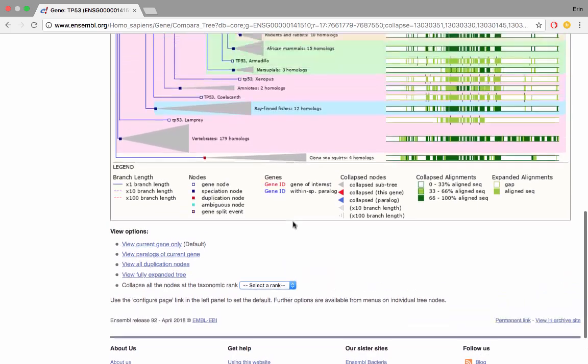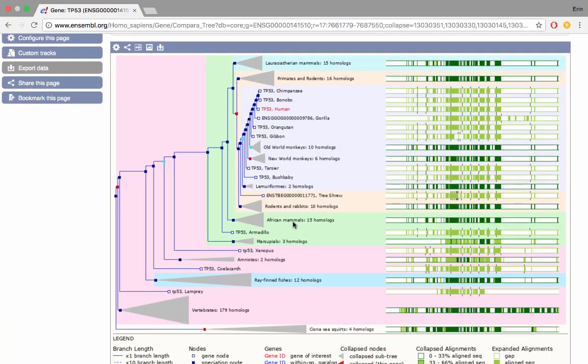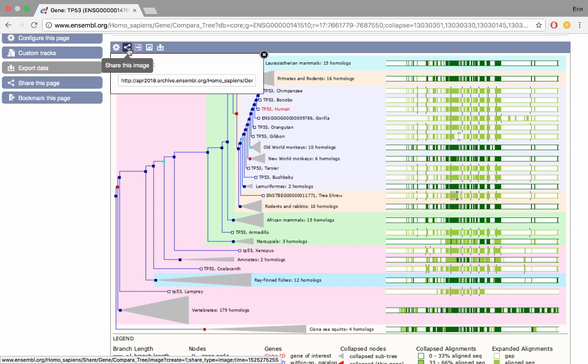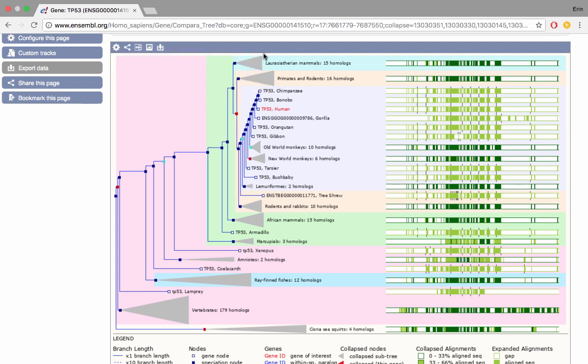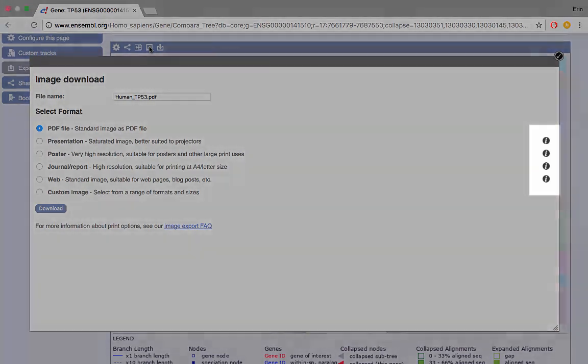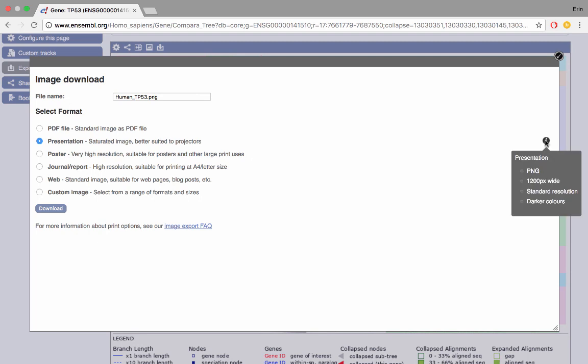Perhaps after editing your image and opening up specific nodes that you're interested in you might want to download or export or share this with your colleagues. We can share this image. If you've expanded any particular nodes or added paralogs for example, if you click on this you'll get a stable URL and this will remember which nodes have been expanded and collapsed and so on, so you'll be able to share this exact image with your colleagues. We also have an option to export the image which will be able to capture the image as you see it in Ensembl in a range of different formats depending on what your purposes are, so for example a journal format or a PDF.